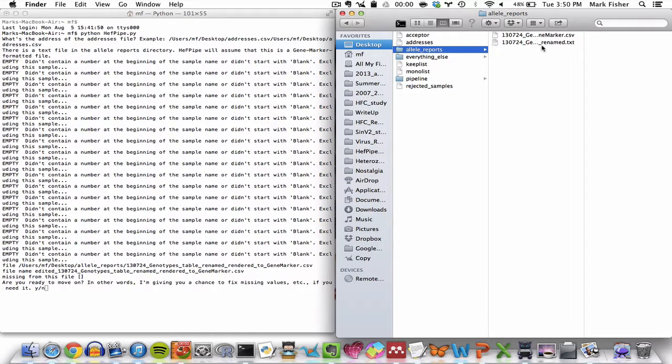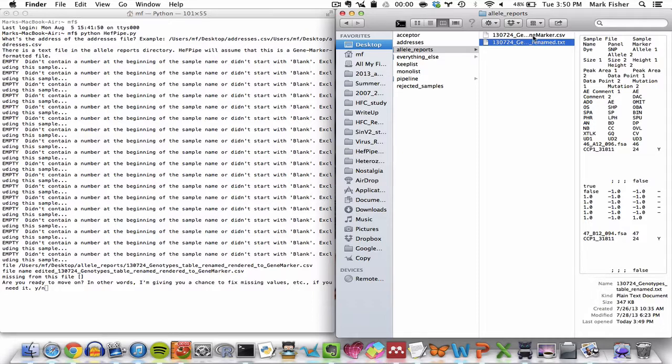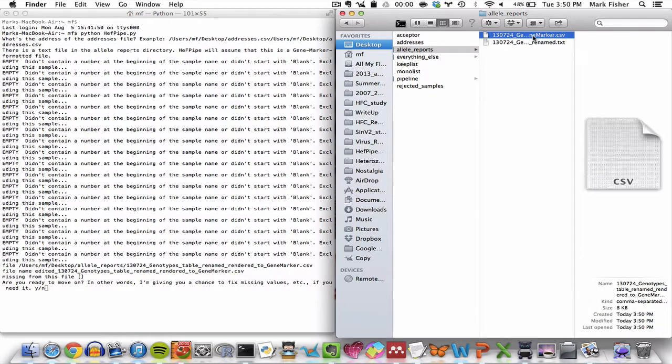So it finds this .txt file and it knows that that has to be a GeneMapper formatted file, which it then converts into a .csv formatted report, which you can see gets produced above.